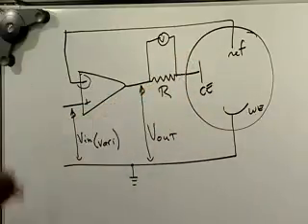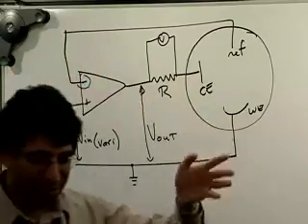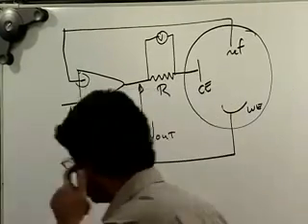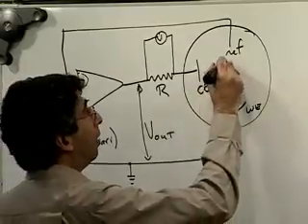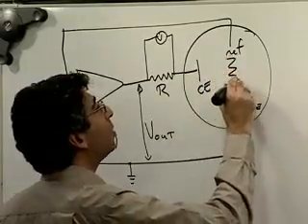So now we don't need our undergraduate anymore, our freshman. We're in great shape. This little guy will do it. This is a negative feedback loop, and it does exactly what our freshman was going to do for us. Now, as I pointed out, you could think of the region between the reference electrode and the working electrode as a resistance.